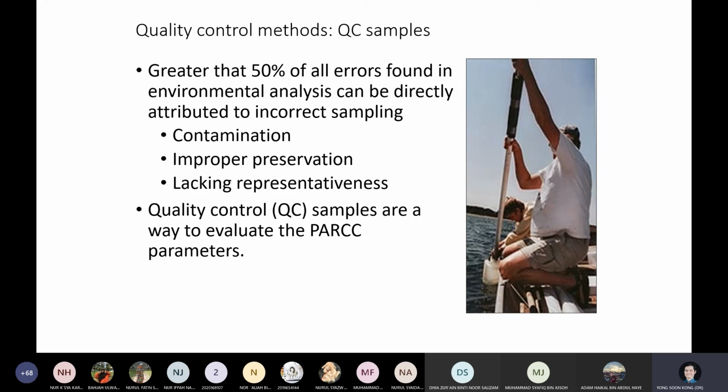Make sure that we have as accurate as possible a representation of your sample water, so that when you measure it, you have confidence that your data does represent the environment, the water that you intend to sample, and the data that you have measured is accurate. So it's paramount that you know the actual result and have the confidence to believe so.